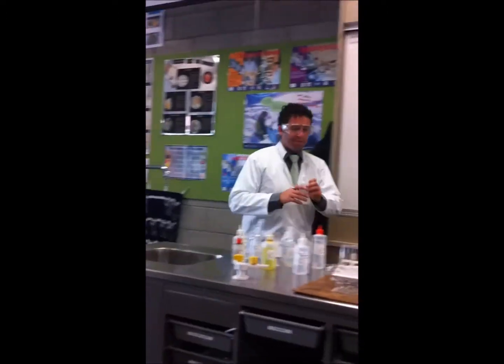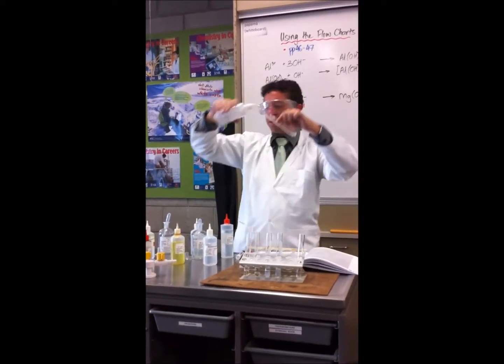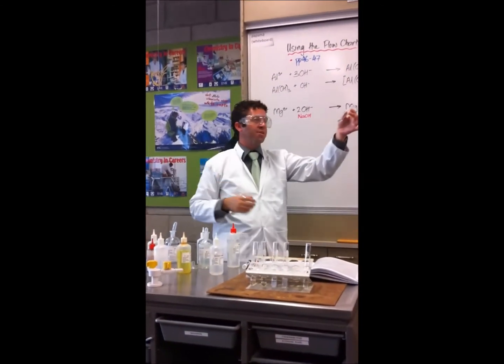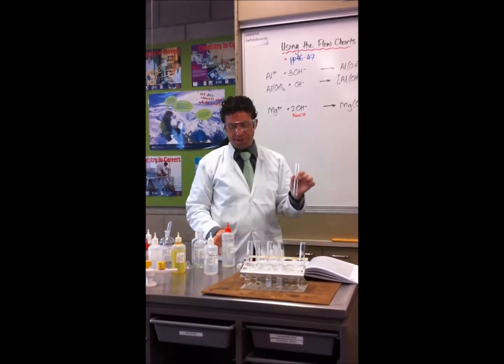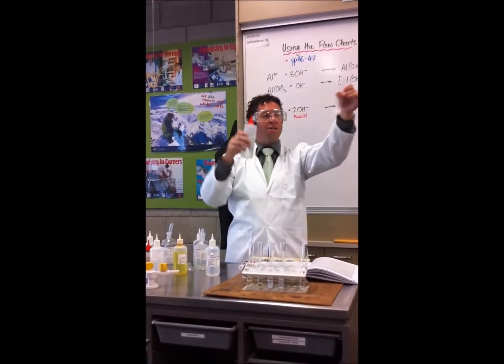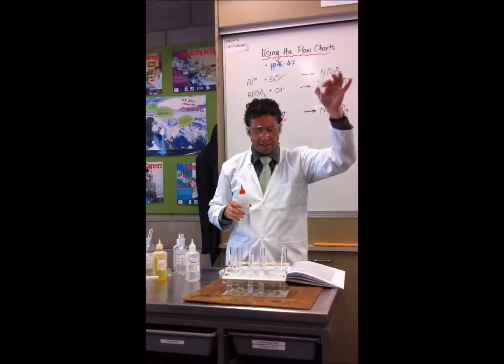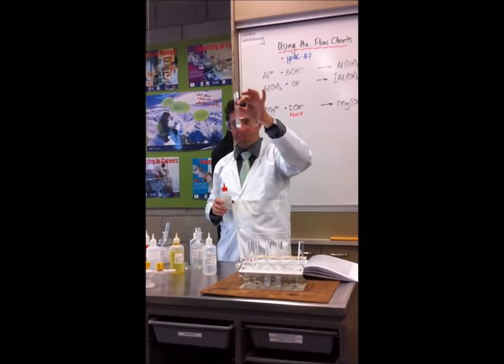Choose that one because I like doing this experiment. Okay, so a little bit of this one. Again, it's a colourless one, so it's not copper, it's not iron 2, it's not iron 3. The first step is always a couple of drops of sodium hydroxide. And it goes cloudy. Well, very cloudy. Okay? So again, it's lead, aluminium, zinc, or magnesium.